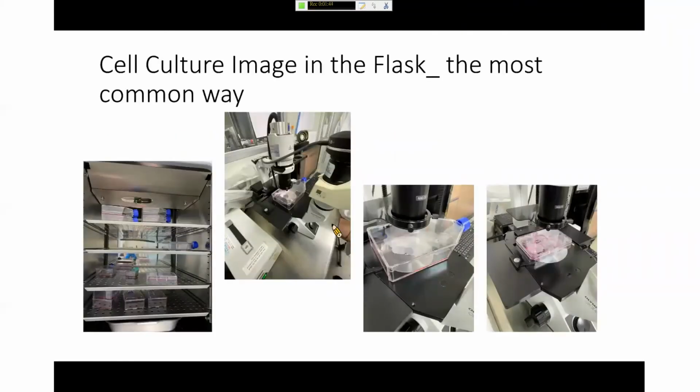Generally, we culture cells in a flask or dish, and after infection, we observe the cell CPE under the microscope and record the imaging by camera.